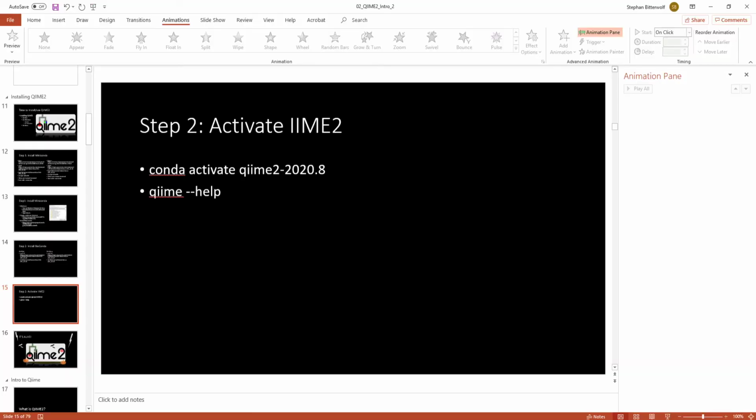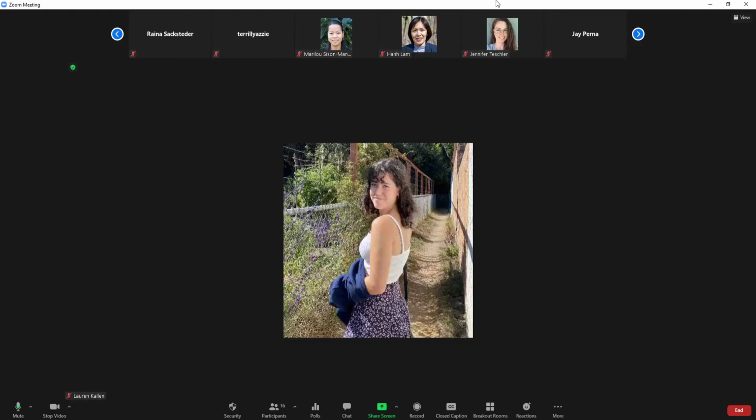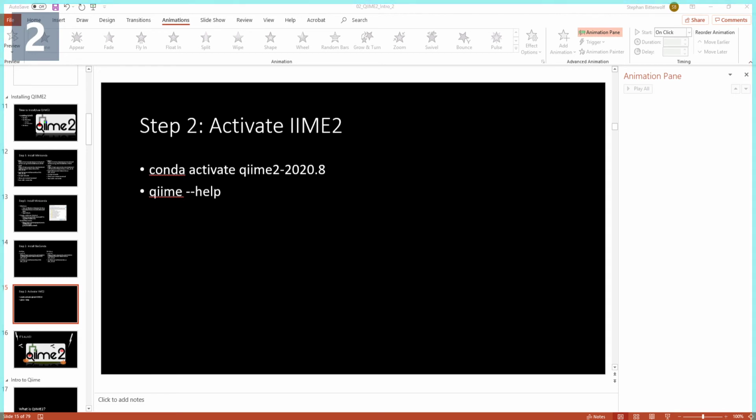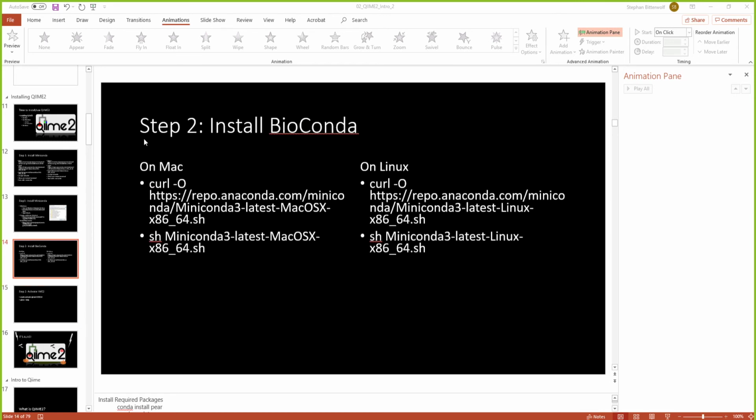Okay, well, it is 3:08. We'll get back to just finishing this up. I'll give you guys a brief presentation as to what is happening for QIIME2. So if you have any issues that you can't deal with or can't fix in this session, that's okay. You should be able to work on it over the weekend or next week and hopefully fix some of those errors, like what you were reporting, Lauren.